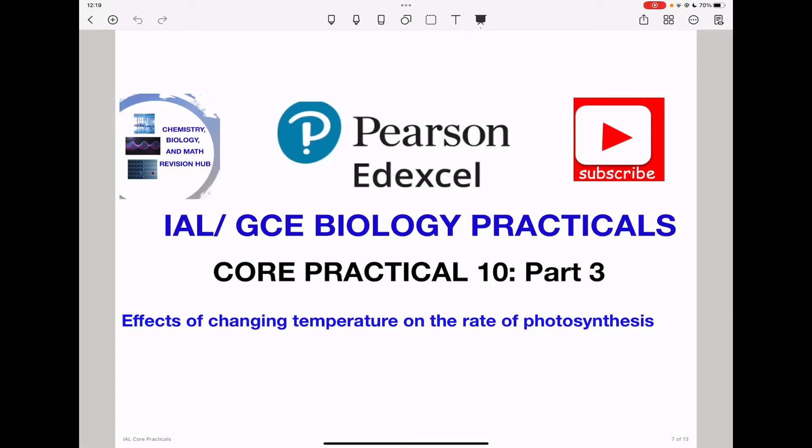Today we are doing the Pearson Edexcel International A-Level and GCE Biology Practicals. This is Core Practical 10, Part 3.